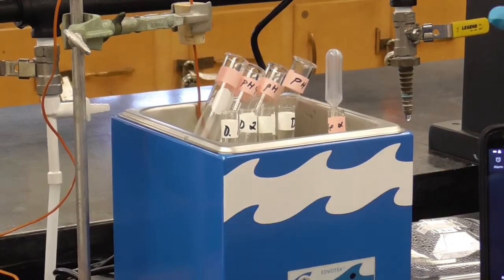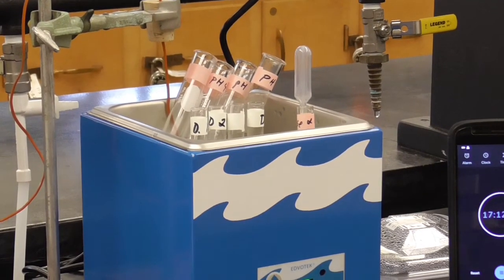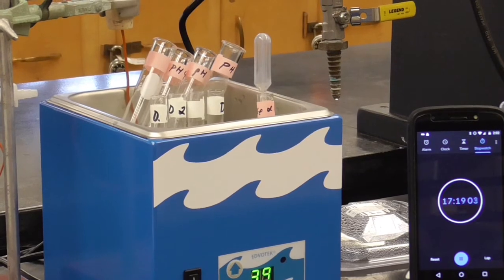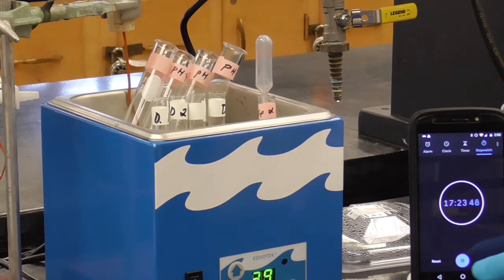So it's all set to go. We just need to let it have a little time to come up to the right pH, right temperature. So we'll give it about 5 minutes or so. The procedure says about 5 minutes. I suppose we should reset this.